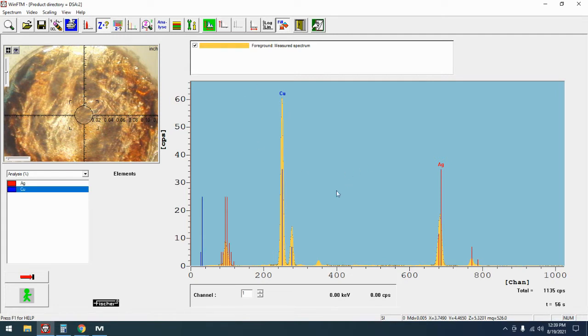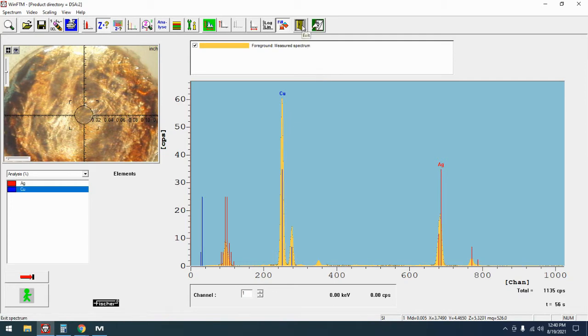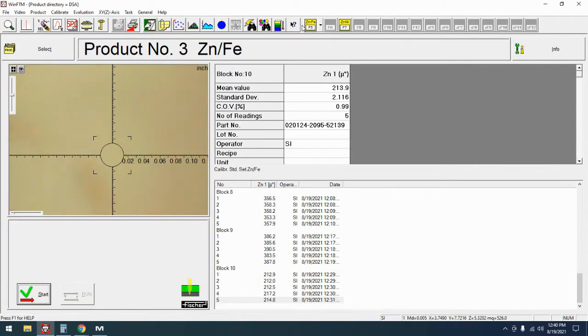This may be all you need to bring a calibration back into expected tolerances. You may still need to do more after that but this is always a good place to start. So let's talk about how to do this.